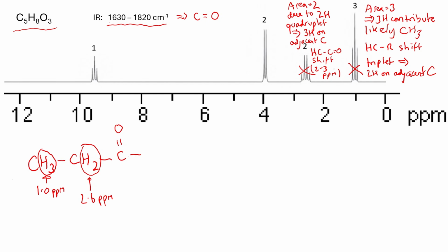Now at this point you've got 2 split peaks, and you know that split peaks arise when you have hydrogens on adjacent carbons. So when you think about it, it's kind of obvious that these 2 peaks must come from sets of CHs that are next door to each other. So we know we're going to have a structure that has 2 carbons like this, just from the fact that you've got the 2 split peaks like that. So again, let's just pick one of them and start with that. So let's look at this one.